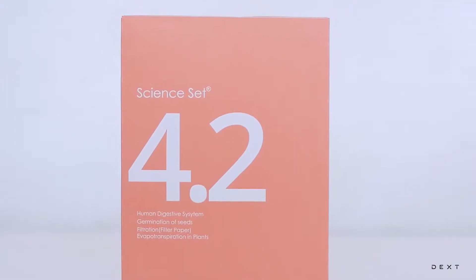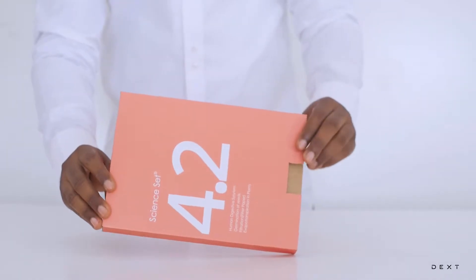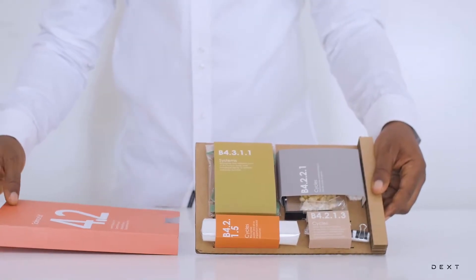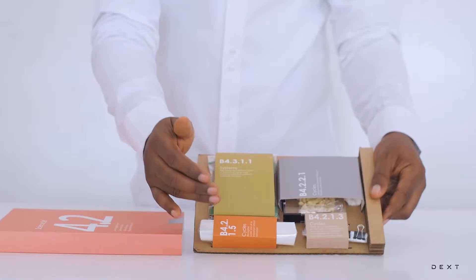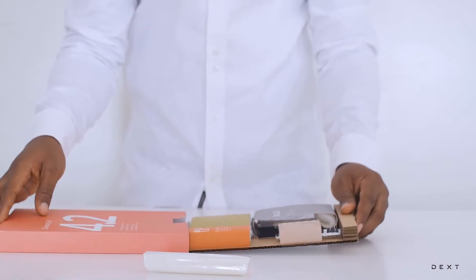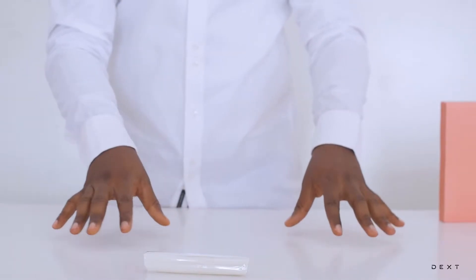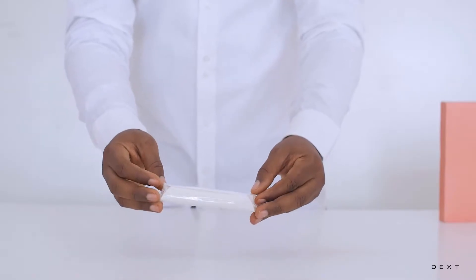This is a tutorial for Dext Science Set 4.2. Welcome to another video. This video is for the Science Set 4.2 and we are going to be learning about filtration using materials from compartment B4.2.1.5. By the end of this activity, you're going to understand how to perform an activity to demonstrate filtration and also know the materials you need to do a simple filtration activity.